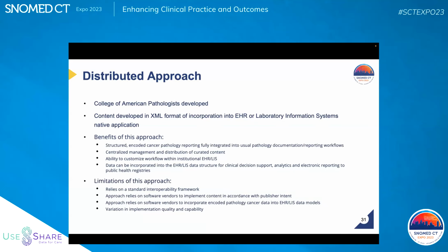Intuitive from Glenn Conway back, his company, it helps with this as well. It integrates into the workflow of the pathologist with their electronic health record system or laboratory information system. So their typical workflow is not disrupted. There is some centralized management of the content. Unfortunately, the limitations are that you do require your electronic health record vendor, or your LIS vendor, to be able to ingest the forms, the logic of the forms.